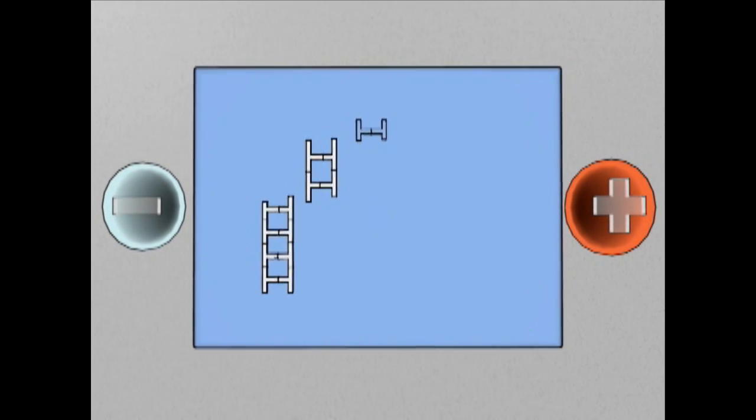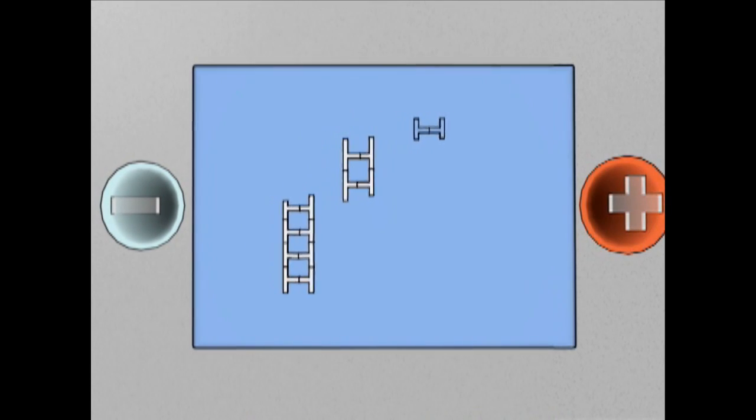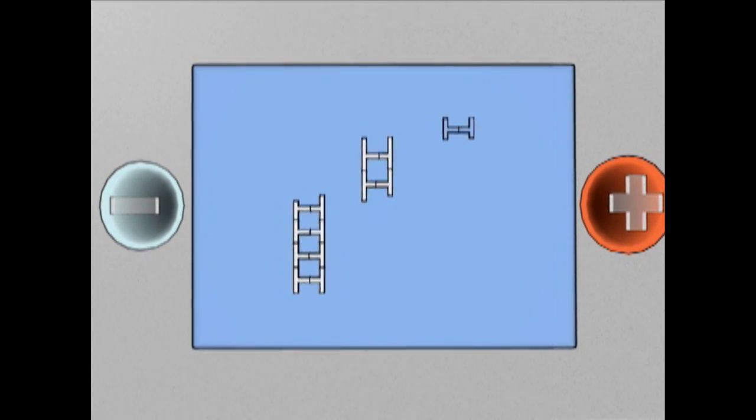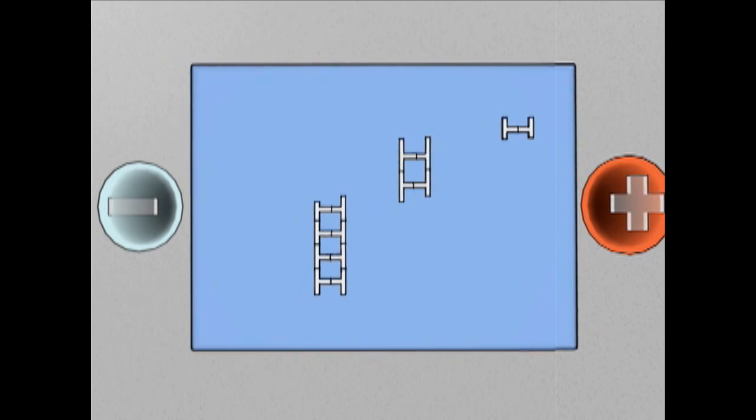Therefore, if the electric field is applied for a given amount of time, the molecules will arrange themselves by size on the tray. Those closest to the positive electrode are the smallest, and those farthest away are the largest.